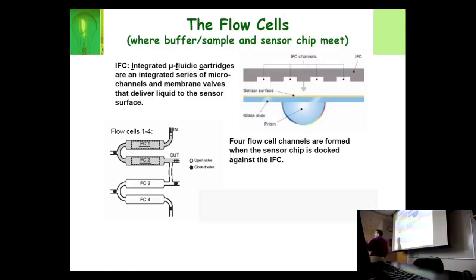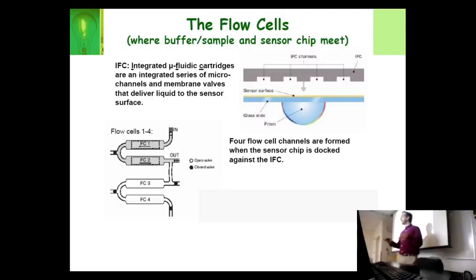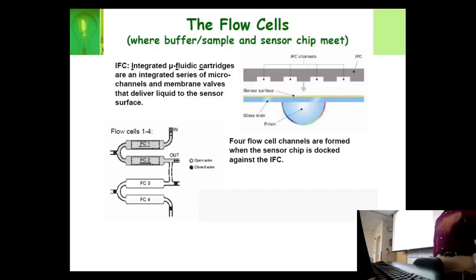So the one thing you should be ready for when we do BIAcore is it's going to be loud. Well, not really that loud, but it's going to be sudden hisses of air. It's going to be a little bit like a steampunk factory or something like that. It's actually pneumatic in a certain way, because you're using the air to push on the rubber part of the IFC and to open and close these channels. You'll get used to it really fast. It's just that it might startle you a few times.